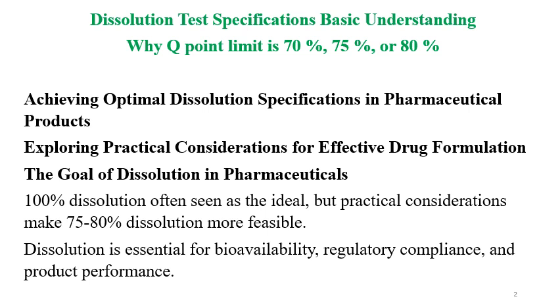Exploring practical considerations for effective drug formulations. This will be the objective. The goal of dissolution in the pharmaceuticals. So what is the goal? Why do we do the dissolution testing?